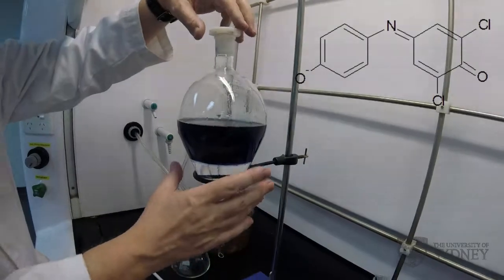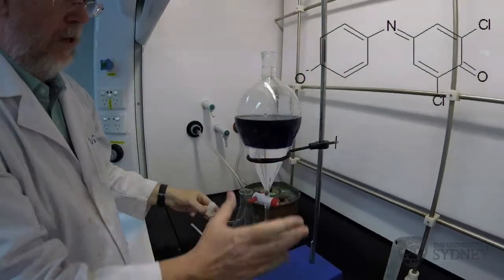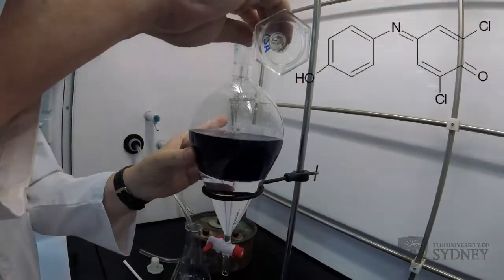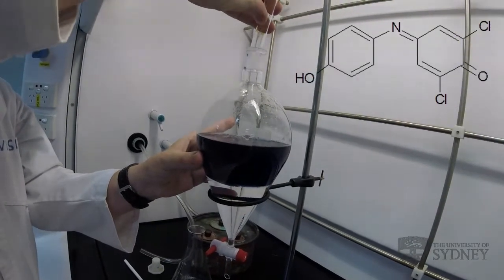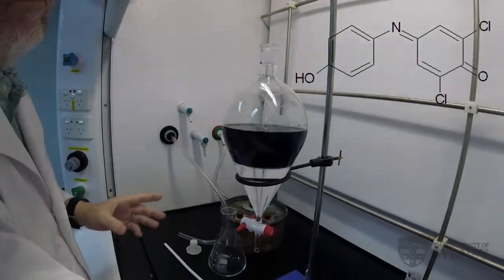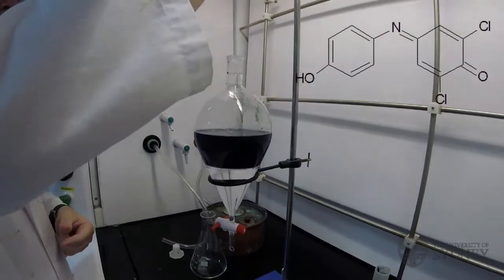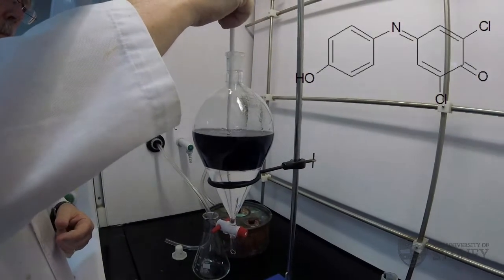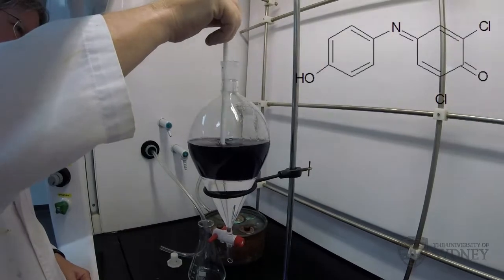Let's protonate it. So I'm going to add a small amount of HCl, which will protonate the indicator and cause it to change color into its acidic form.